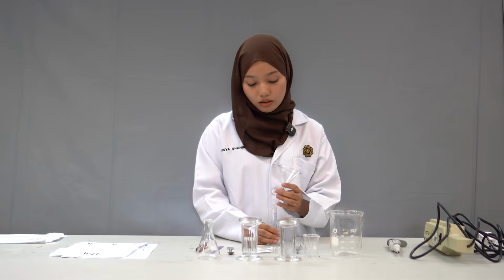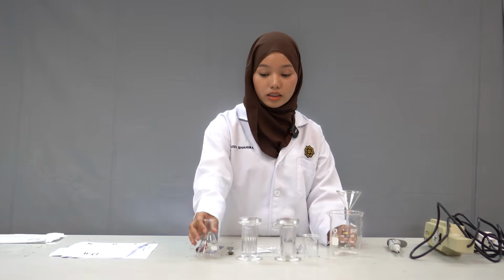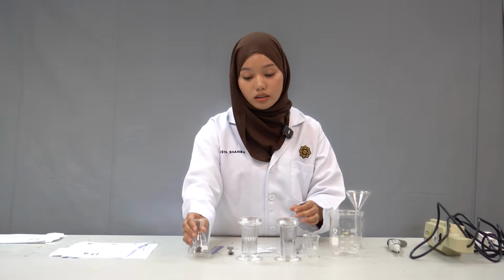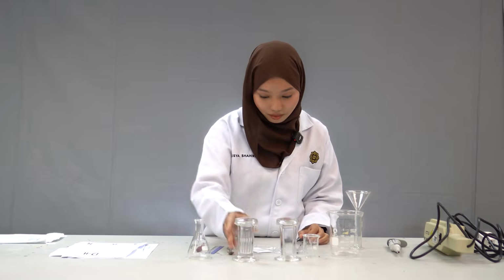Next, using a measuring cylinder and filter funnel, we put 5 ml of each developing solvent into the developing chamber, and make sure to close the lid to prevent the solvent from evaporating.